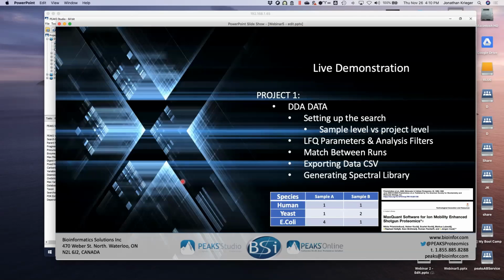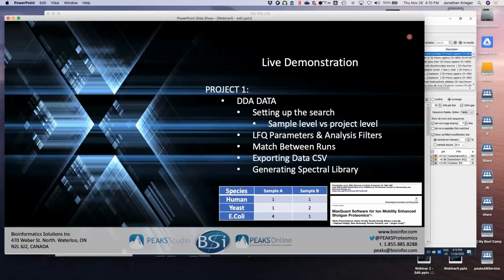So what I hope to show is a couple of projects that I've run in Studio. And if you're an online user and want me to show them in online, I have them in online, so I can do that as well. Feel free to just unmute and let me know.